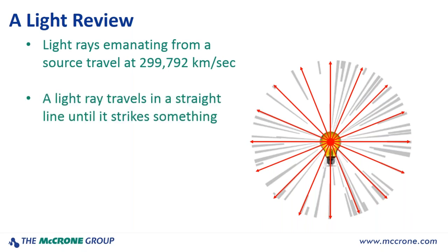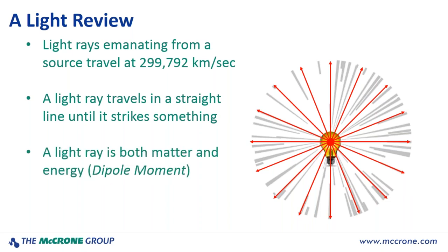Light rays tend to travel in a straight line until they strike something, which we're going to take advantage of. And a light ray is considered to be both matter and energy, although my colleagues who are physicists would rather I mention a dipole moment. But for me, a little bit of both is better.